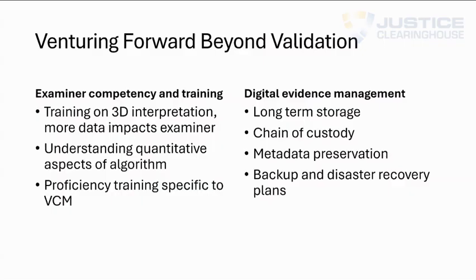So it is important to receive appropriate training in the interpretation of the data that we're viewing, and to be able to have some sort of calibration of our identification criteria from light comparison microscopy to virtual comparison microscopy. In addition, it's going to be important to understand the quantitative aspects of the algorithm.